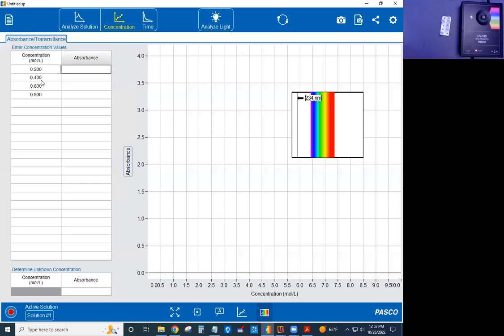So there's this table that has concentrations. I said that I like to use millimoles per liter because with molarity it's hard to put in those exponents. I'd rather just not use exponents, and in that case I can do millimoles per liter. And you can calculate, if you use the dilution equation, M1V1 equals M2V2, the concentrations of each of the solutions I made. So solution A, the first one, is 0.044 millimolar. And solution B is 0.089. How did I get these? Well, I just did some chemistry math.